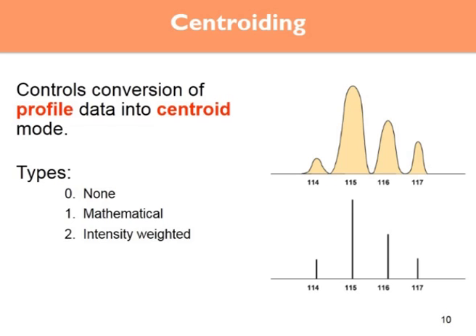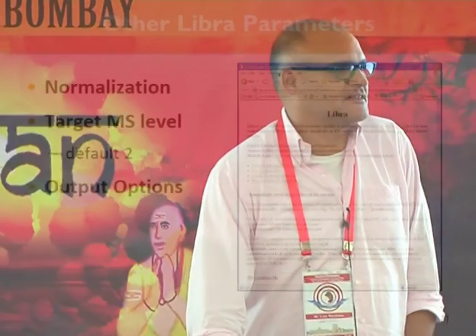Yeah, we haven't. If you have 2 peptide ions, and they're both iTRAQ labeled, all fragmenting at the same time, obviously we can do a search to identify the other one, but I don't know, we don't have any way of rejecting the ratio or anything for that.